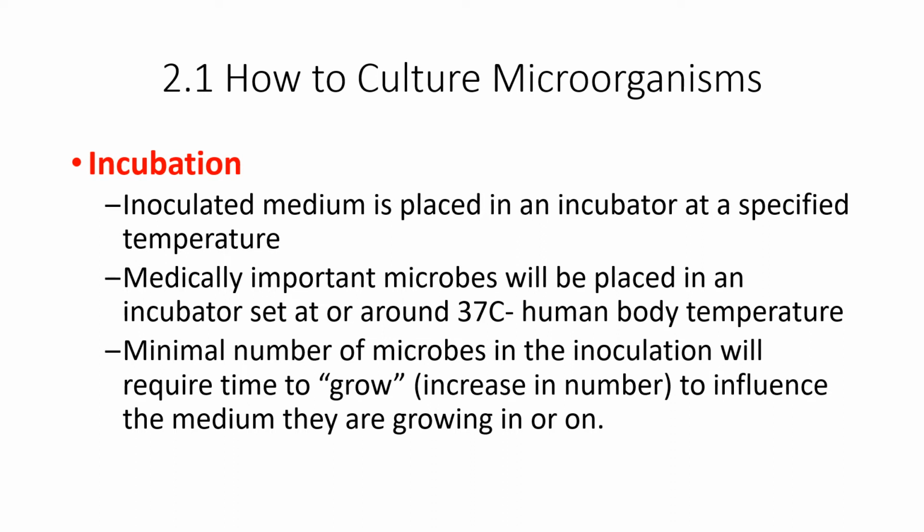Now, this incubation, not only is it time, but it's also maintaining an environment. Temperature, it turns out, is very important. The majority of microbes that will infect humans like to grow around 37 degrees Celsius, give or take a few degrees, 35 to 39 tops. So you'll put them in a special chamber called an incubator. That incubator will hold the interior at whatever you set it at, 35, 37, whatever. Microbes have the water, they have the nutrients, and they're kept at the correct temperature they need to grow.